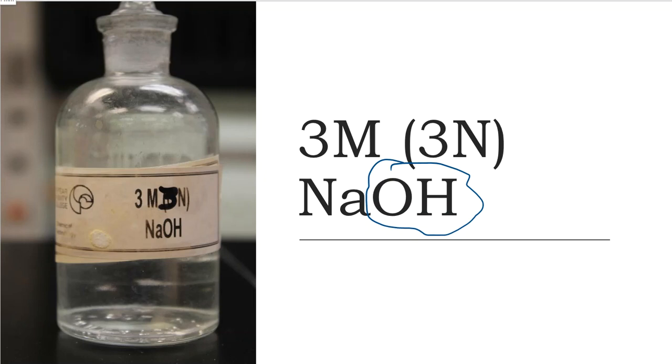Here is the bottle of sodium hydroxide that I've decided to use in the lab. Folks, this has been made by somebody. I don't know who made this. I hope they made it right. But for the label information here, we're going to put stock. All right, now on this label, you're going to see M and N. M is going to stand for molarity, which is what they tell you about in general chemistry all the time. And they act like molarity is the best thing since sliced bread.